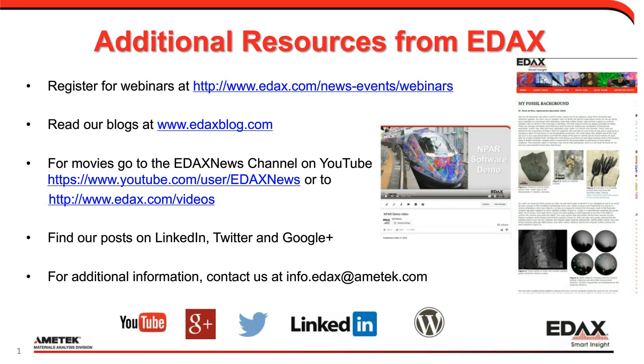For the dictionary method, do you need to collect the backgrounds? Another question that has come through. I would say yes, go ahead and collect it. We have done it without the background and with the background, but I haven't really proven it either way. My gut tells me that we might as well get as good a pattern as we can for the comparison, and the background correction will help with that. Just use the same standard approach to collecting the background, or you could go ahead and use the simulated, either way. Both will be available in the software.